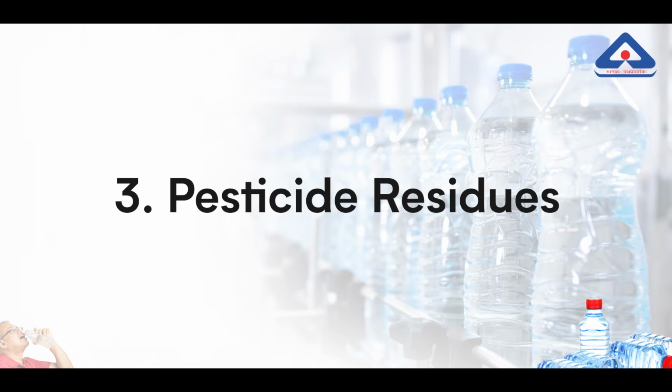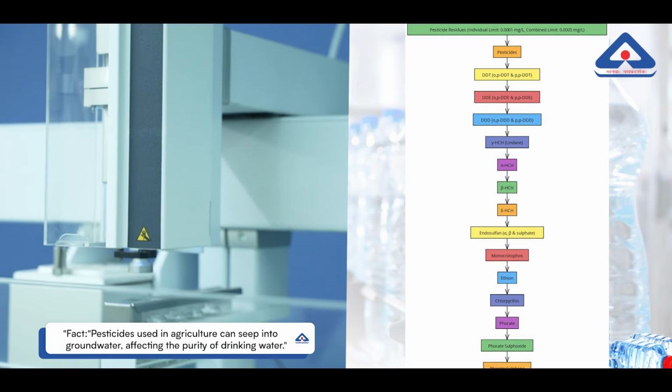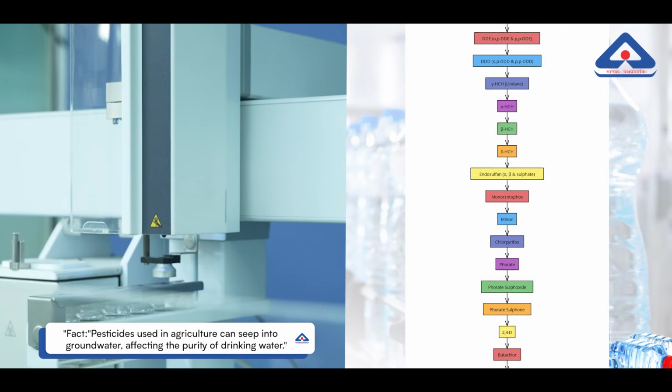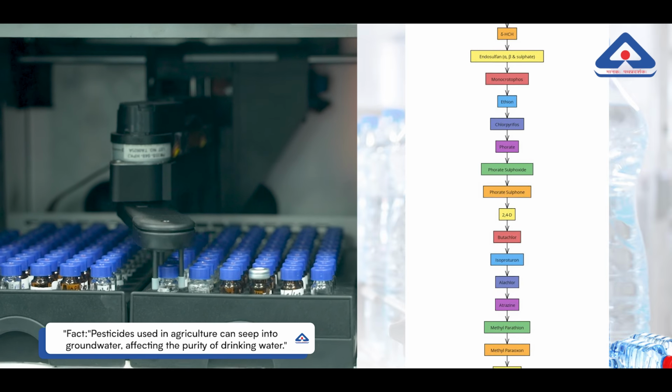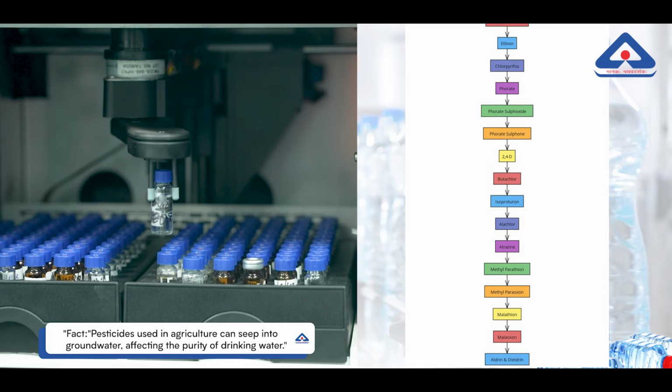3. Pesticide residues. Pesticide residues can be harmful, so we test for traces of pesticides. 30 pesticide residues are tested to meet safety standards.